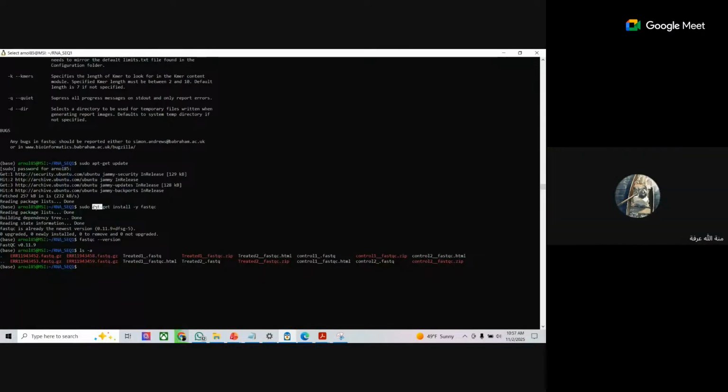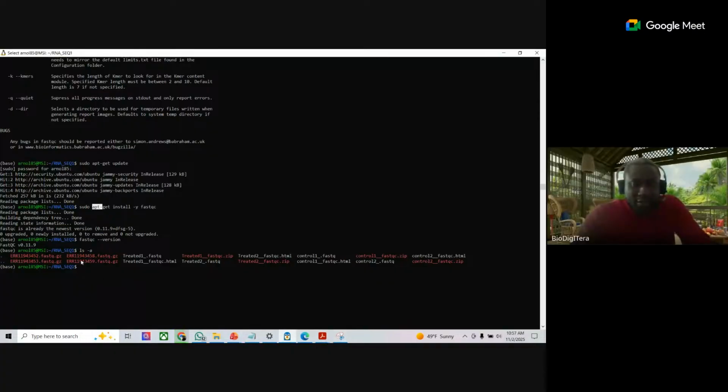Thank you very much. Okay, guys, type ls and you press enter. I suggest you make sure that you are able to see the file that you downloaded yesterday with all your samples inside. So type ls. Maybe it's better I do something.